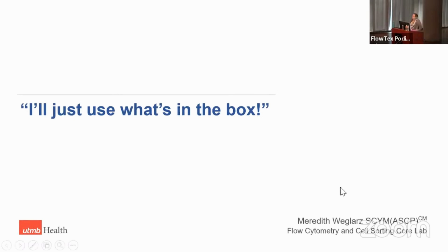All right, so as Amber said, I'm going to talk to you about being in a flow core and the most common phrase of, "Well, I just put my panel together with whatever was in the fridge or in the box." So I'm sure we all have a lot of experience with that. And it's very, very common. So I have a really great example for you about why, if you just spend 5 minutes talking to your local flow cytometrist, you may get some better data than what was in the box.